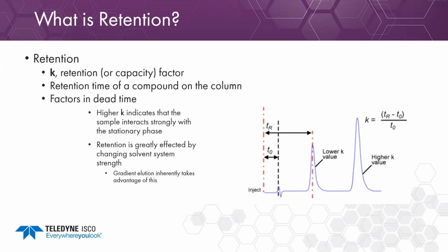and we can take advantage of the separation and the interaction between the stationary phase and the mobile phase of the compound. As we get a retention value that's smaller than 1, that means the compound is basically traveling at the solvent front. So we're not getting really any retention. The compound is not retained at all, and it's traveling with the solvent front at the highest linear velocity.